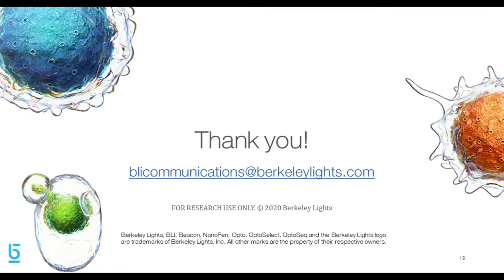Great, thank you. Okay, your next one is, are you able to recover all cells from the chip, or do you notice that you lose cells during the process? So by performing OptoSeq BCR, we now do on-chip cDNA synthesis on beads, and so we're now recovering beads rather than the cells. And our recovery process now is highly efficient, so that we obtain sequences from greater than 80% of all antigen-specific antibodies of interest.